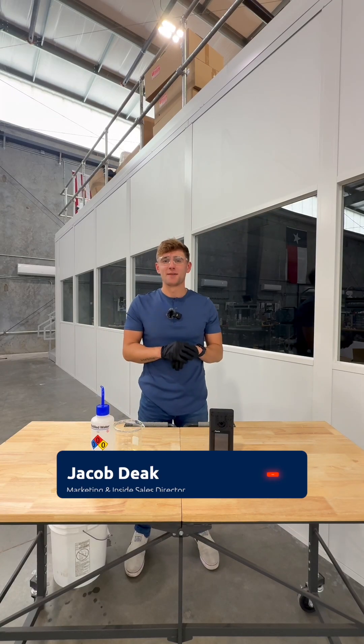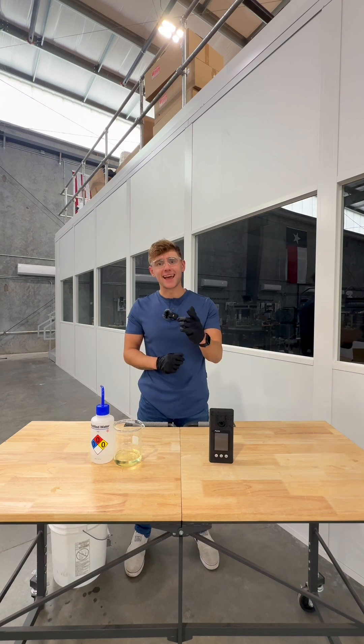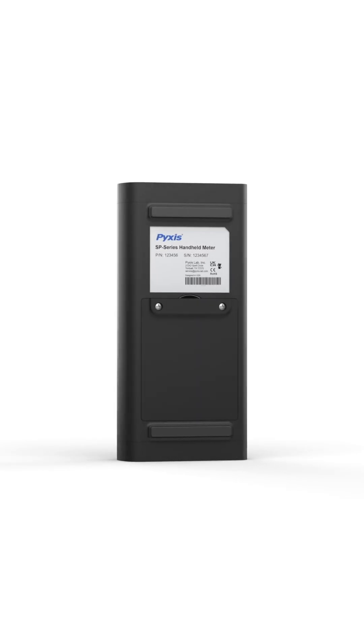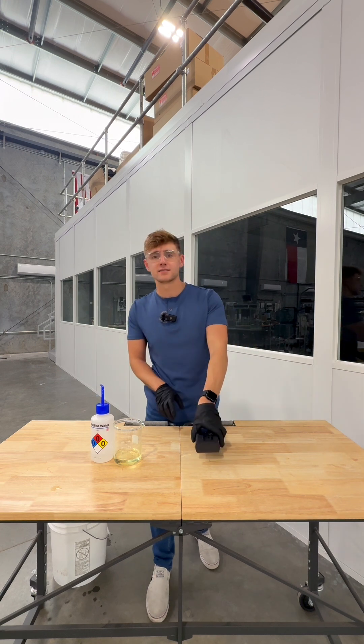Hey everybody, it's Jake Diak with PixisLab. I'm wearing gloves and goggles because today we're dealing with bleach, and Kaibin told me that I had to wear them. I wanted to break down the SP-210 bleach concentration direct pour handheld meter. This thing is so beneficial by comparison to the standard titration methodology. I wanted to show off just how easy it is to conduct a test.